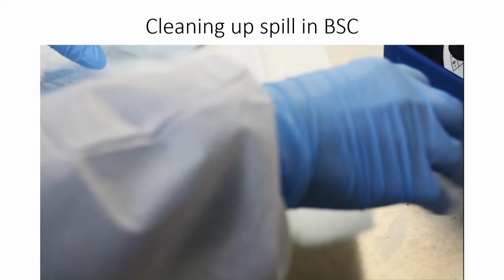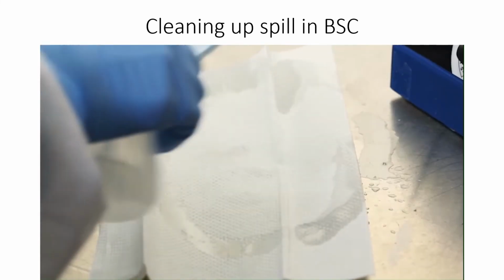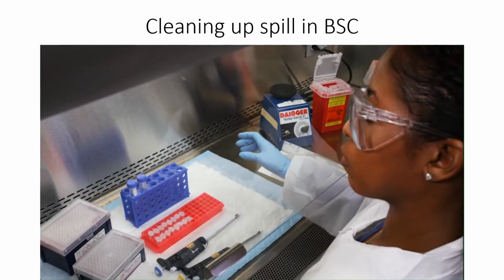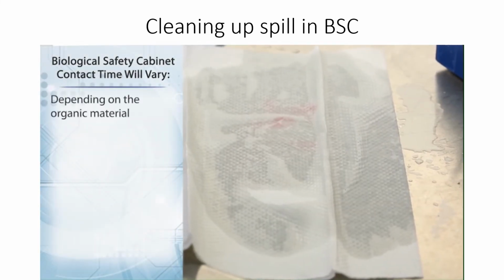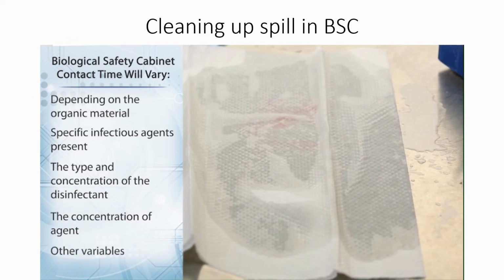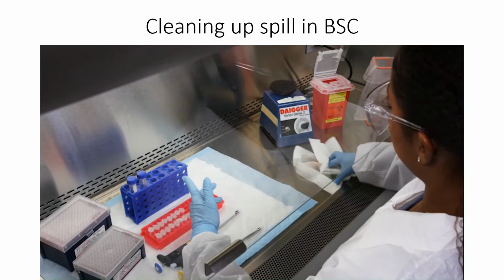Then, repeat the process with more paper towels and disinfectant, this time leaving the wet paper towels on top of the contaminated area for the appropriate contact time to allow for disinfection. Contact time will vary depending on the organic material and specific infectious agents present, the type and concentration of the disinfectant, the concentration of the agent, and other variables. Discard the paper towels in the biohazardous waste container.